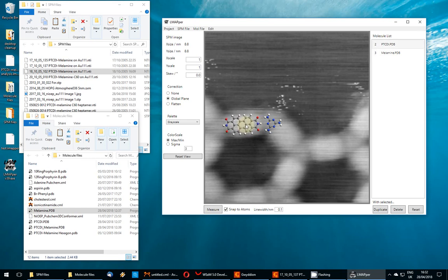and dragging with the left mouse button. See, so you can pan the molecule around. If you use the right click button, it can rotate on its own axis, quite useful for planar molecules, but you can also do a free rotation using the middle mouse button. You can reset if everything went badly wrong.